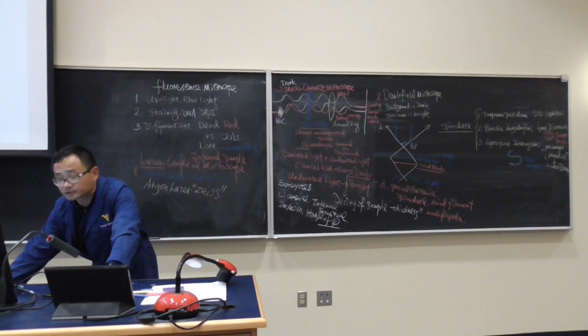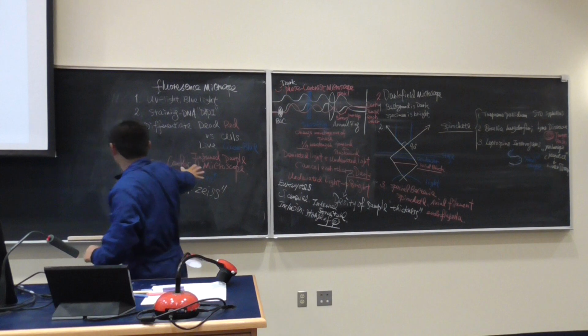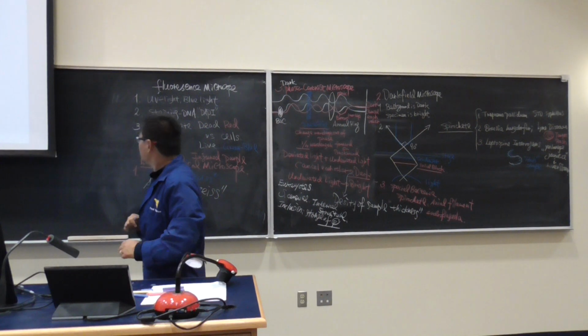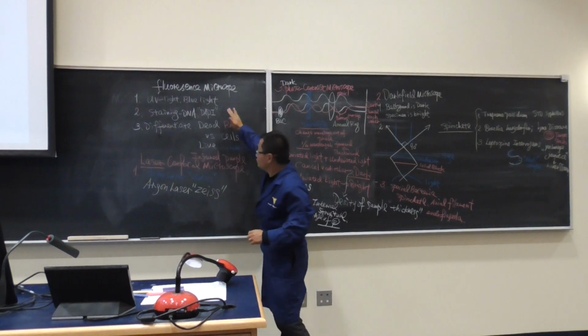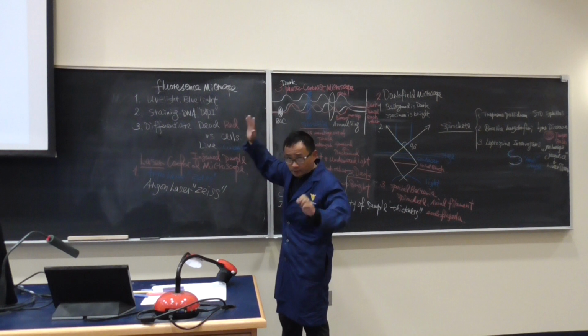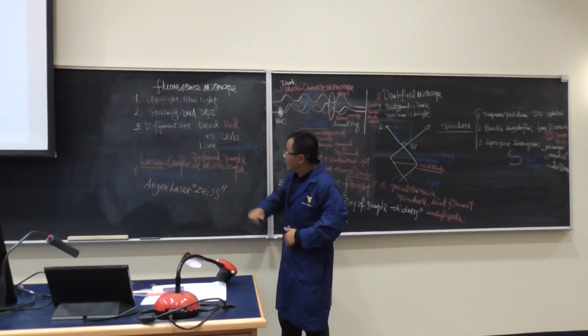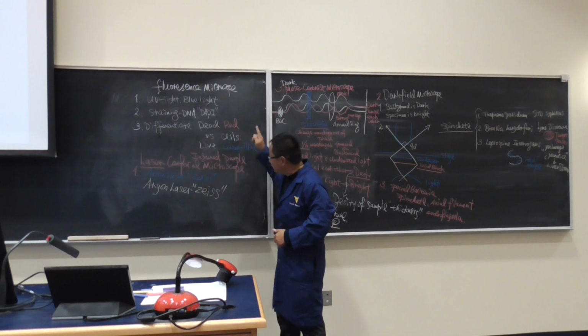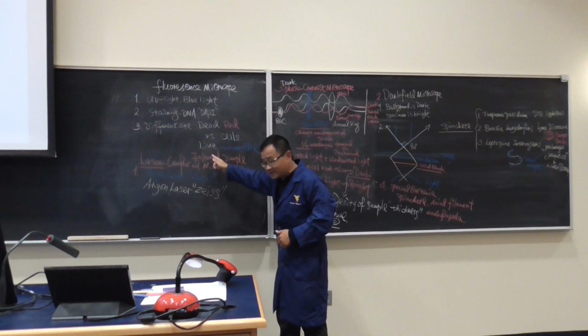That's the Zeiss company. The company is a micro imaging company that generated this laser confocal microscope. Now, what's the advantage for that? Same thing. You can use a stain to stain the DNA of a microbiology cell. And the red one represents dead cell, and the green-blue one represents live cell.